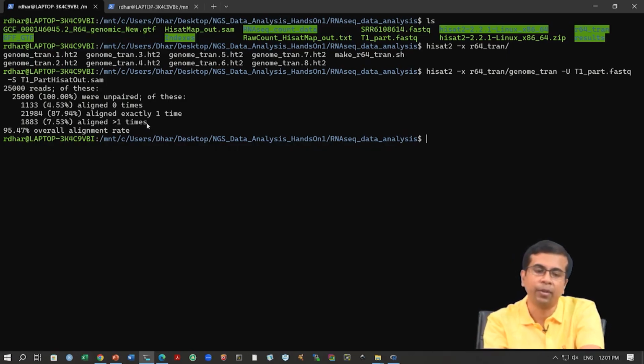Which we will discuss a bit later. What are these tools that we can use to utilize the read data that align to multiple positions in the genome or in the transcriptome, and how do you utilize those to actually estimate transcript abundance. Because discarding them means we are maybe underestimating the abundance of some transcripts, and counting them for multiple genes or transcripts might lead to overestimation for some transcripts. So, this is a very important problem.